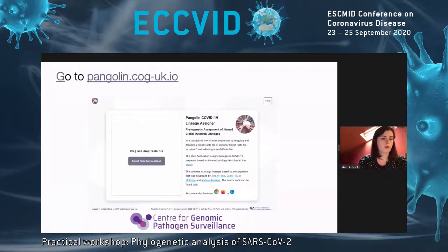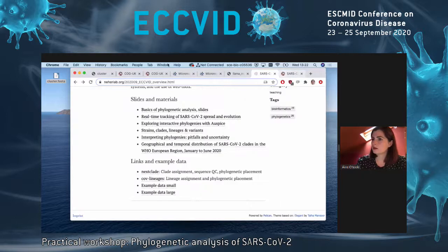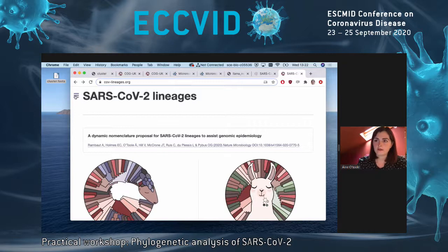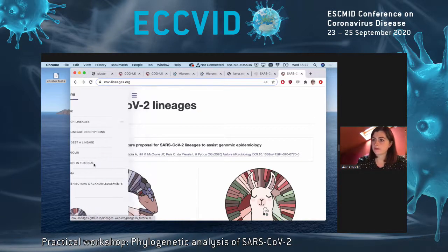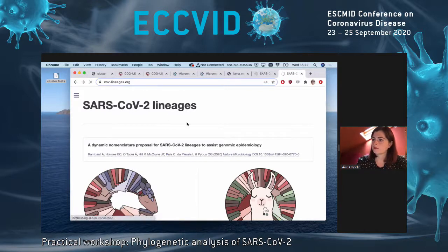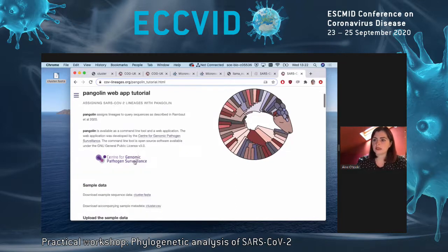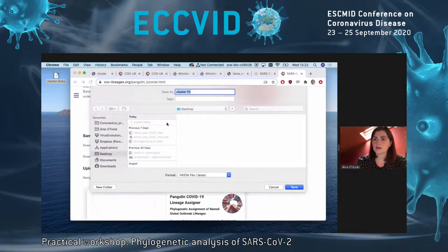So I'm going to stop here for a second. On CoVLineages.org, if you haven't reached it already, we can find the Pangolin tutorial here. And hopefully it will load. Cool. It gives you a little bit of background, and you can download the sample data just by clicking on the FASTA file. I've prepared one earlier.